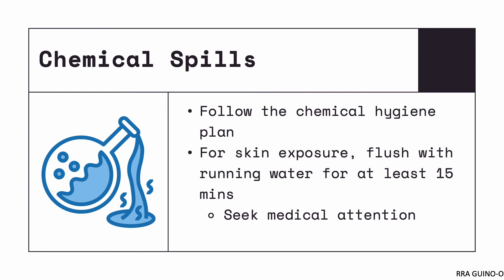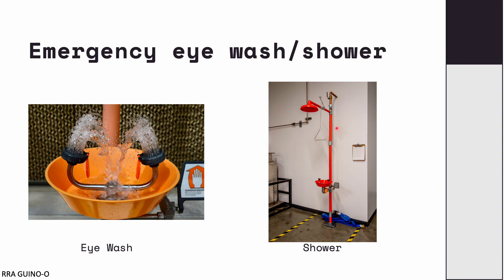In cases of chemical spills, the first thing you should always do is follow the chemical hygiene plan. Each institution should have a chemical hygiene plan in place, and you should be familiar with it before handling any chemical. If you spill chemicals on your skin, you have to flush it with running water for at least 15 minutes before seeking medical attention. Examples of equipment for this include an eyewash station and an emergency shower.